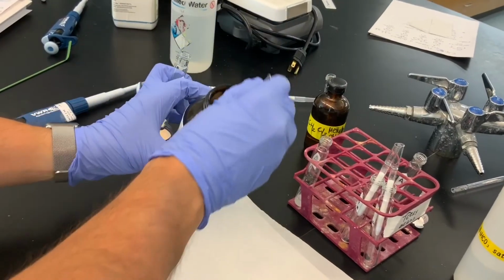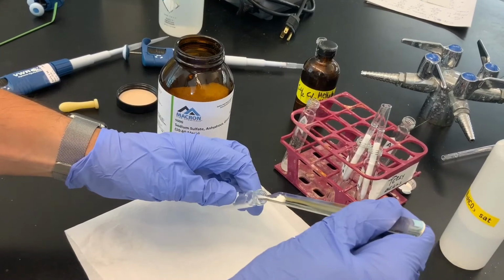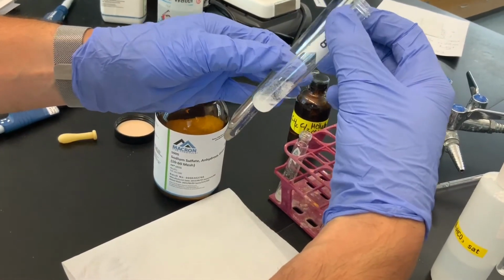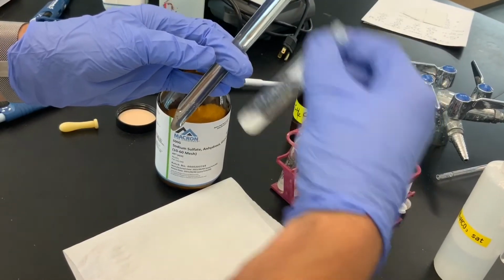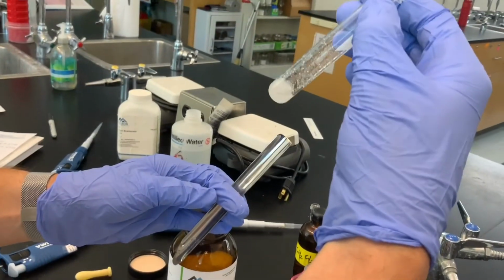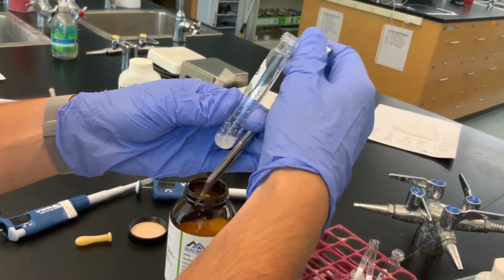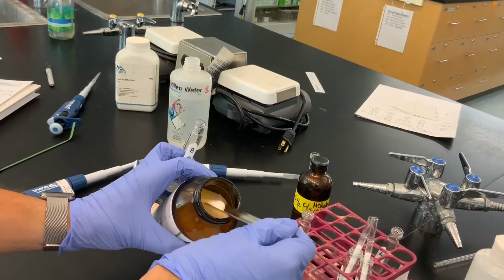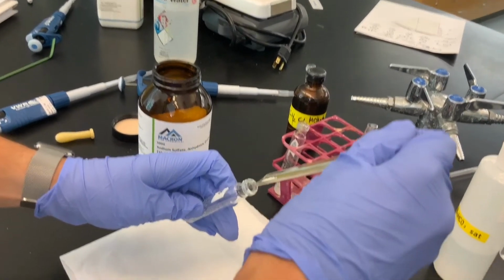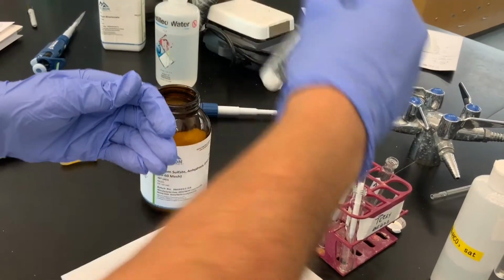Part B, we said, should require a little bit more. See, we see the sodium sulfate stuck to those bubbles of water there immediately. And see, it's chunky and heavier. So we're going to add a little bit more so that it still looks like the granular sodium sulfate that we added, and we get that, quote, snow globe effect. So now we should be good.